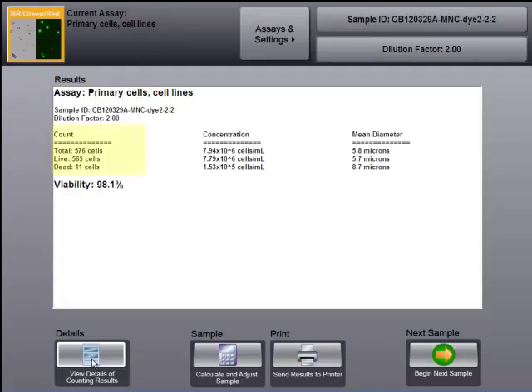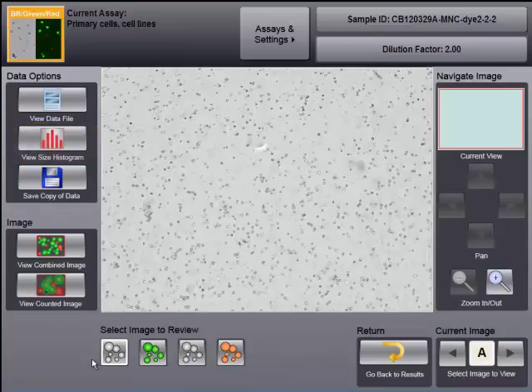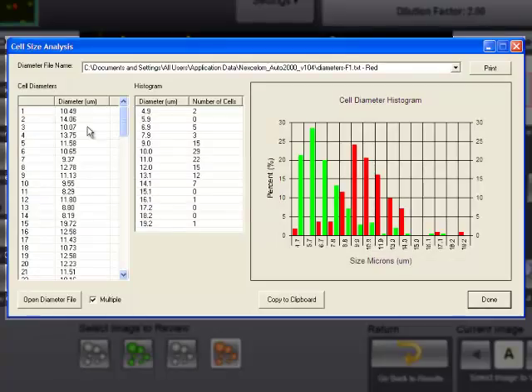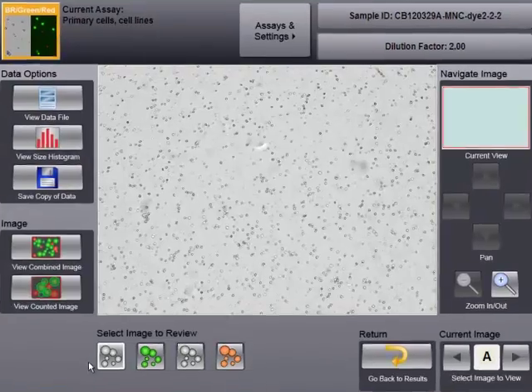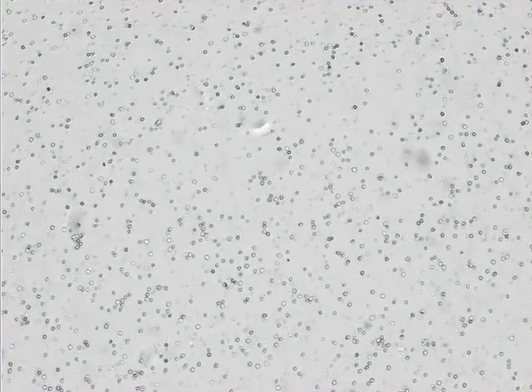In just 30 seconds, the cell count, concentration, mean diameter, and percent viability are displayed on the screen. A cell size histogram can also be viewed.